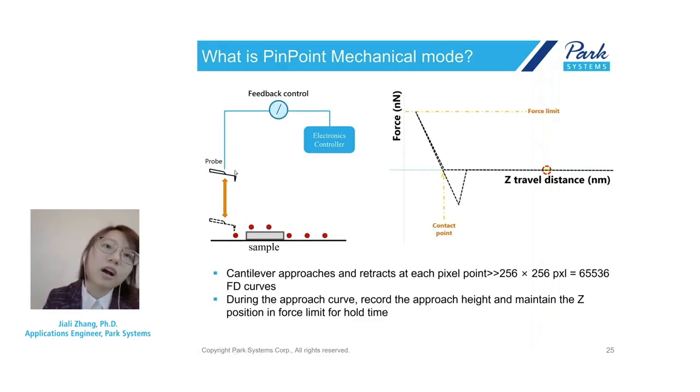During operation, while measuring sample topography, the XY scanner stops at each acquisition point, and during this pause, the Z scanner takes a rapid force distance curve with finely controlled force, distance, and contact time between the tip and the sample surface. We do this approach and retract at each pixel.